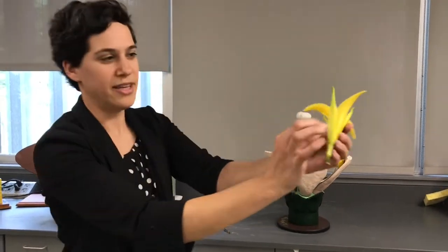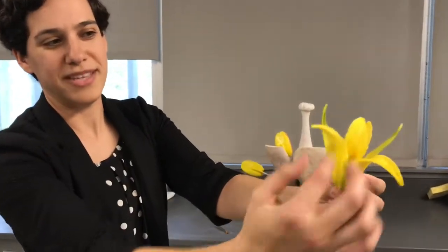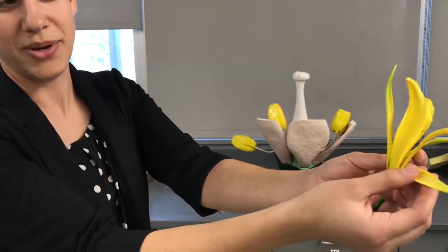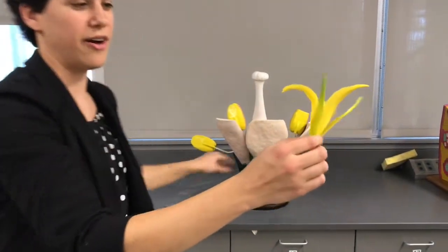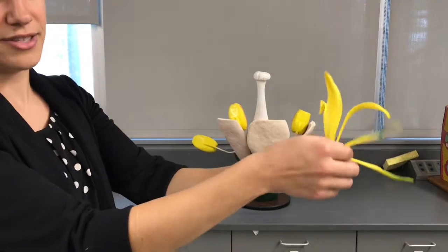So on this lily, these three outer pieces we would call the sepals, and I'm actually going to pull each one off so we can see what's inside of this flower.